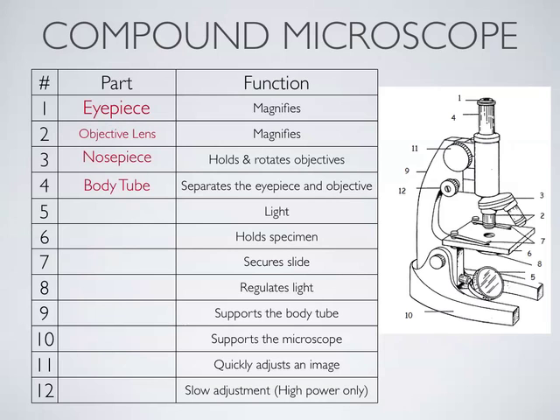Our microscopes, though, are rechargeable. They have a little LED light in the bottom. This one, the battery's dead, but it has the light built in, the light source. Oh, is it okay if I said mirror slash? Yeah, that's fine. We won't ever use microscopes with a mirror, but they are around.